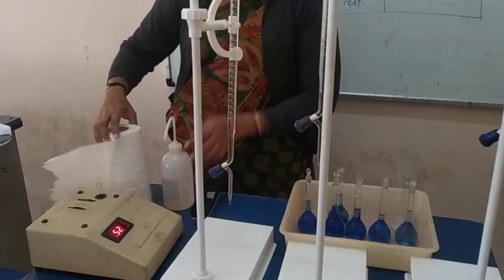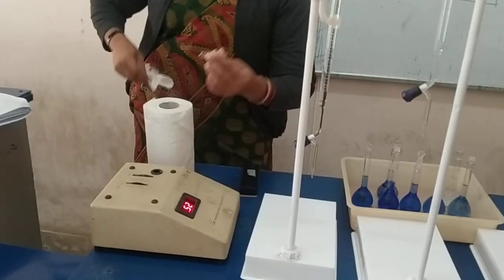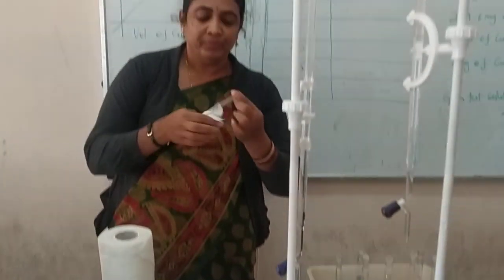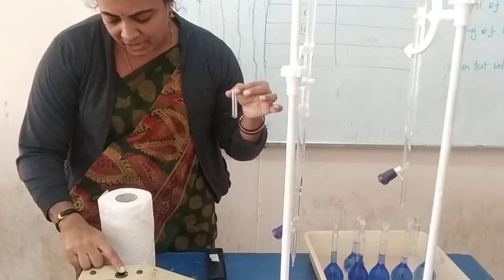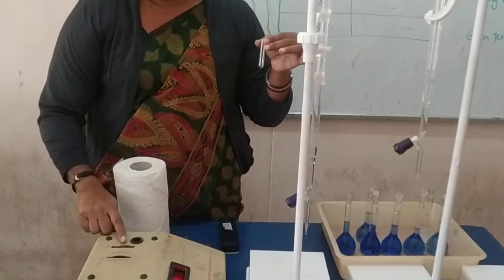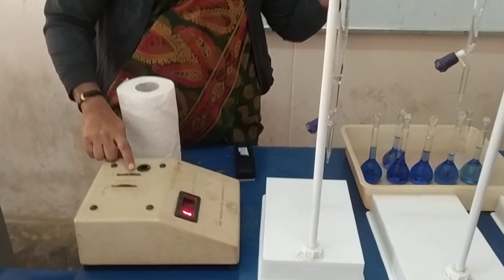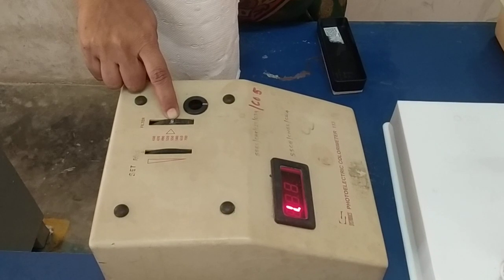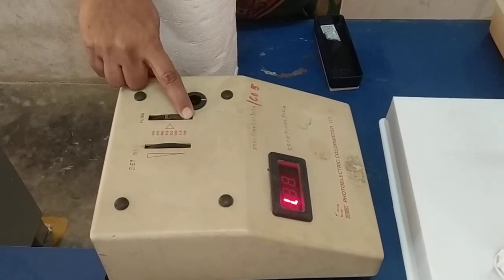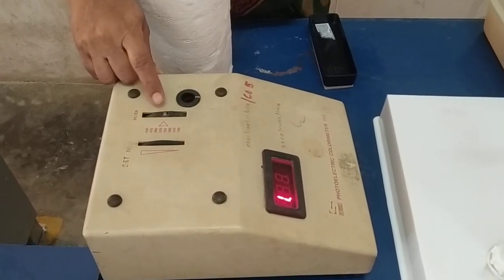Then we just have to measure the optical density. For that, we are using the photoelectric colorimeter. This is a cuvette — we place the solution in the knob provided here and choose the required wavelength. For copper sulfate, we are measuring at 620 nanometers. Since 620 may not be exactly available, we choose 61 on this instrument, which is close to 620.